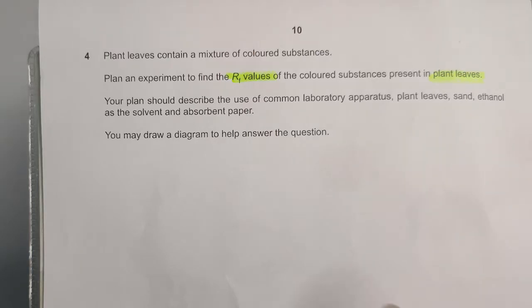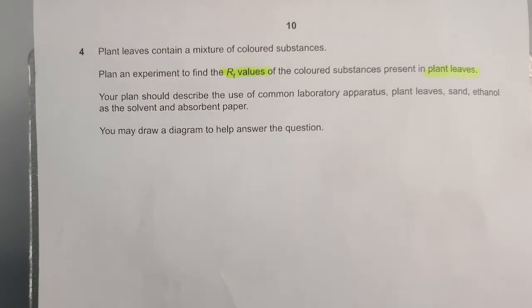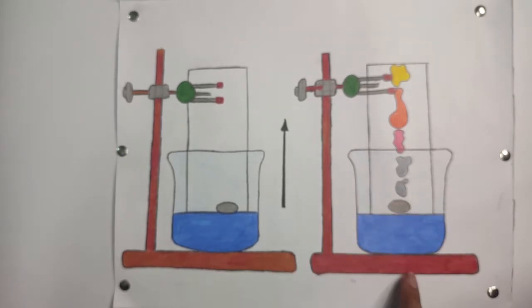Before I solve this question on this paper, first of all I would like to tell you what the chromatography technique basically is and how we will perform this experiment. In the first step, we will take some leaves. We will crush and grind the plant leaves. Then we will decant and pour off the filtered liquid.